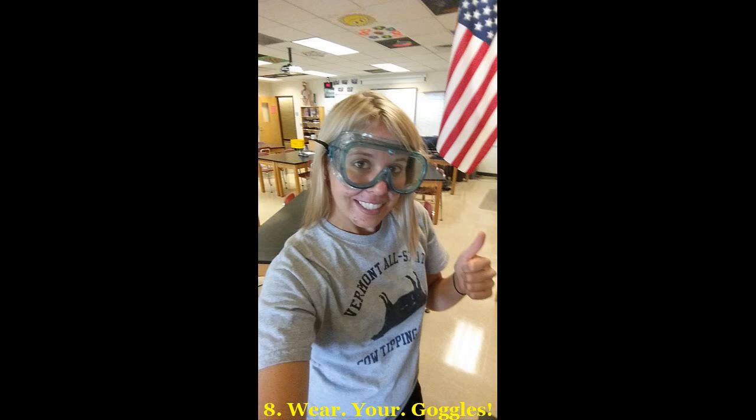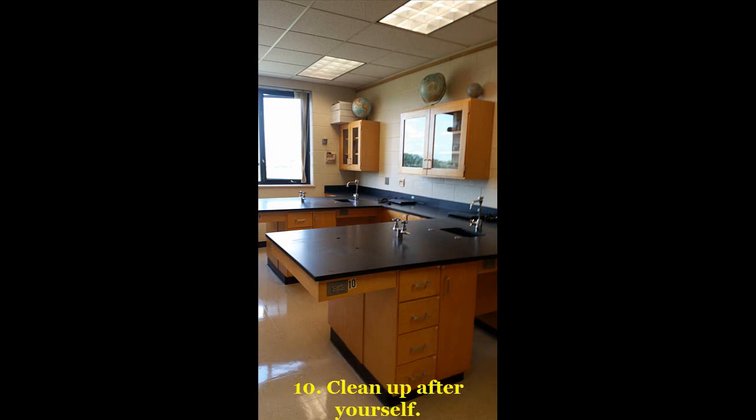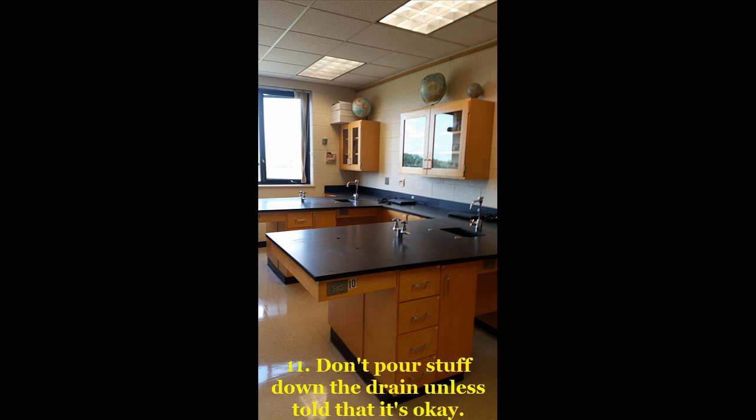No exceptions. Number 9, keep your work area and the classroom clean. Bring only your lab instructions and something to write with back to the lab with you. Number 10, clean up after yourself. Put things away. Basically, that's all number 10 says. Number 11, follow my instructions for disposing of things. There are certain chemicals that are hazardous if they go down the drain, and so I'll have you put them in a different container on purpose. Please don't pour them down the drain if I tell you it's not okay.